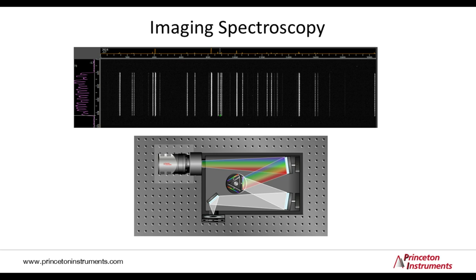So in fact, all spectrographs are imaging instruments, no matter what the detector is in the end, even if one uses a single channel detector. And ultimately, the performance is typically limited by image aberrations or the instrument-specific response to the spectrum.